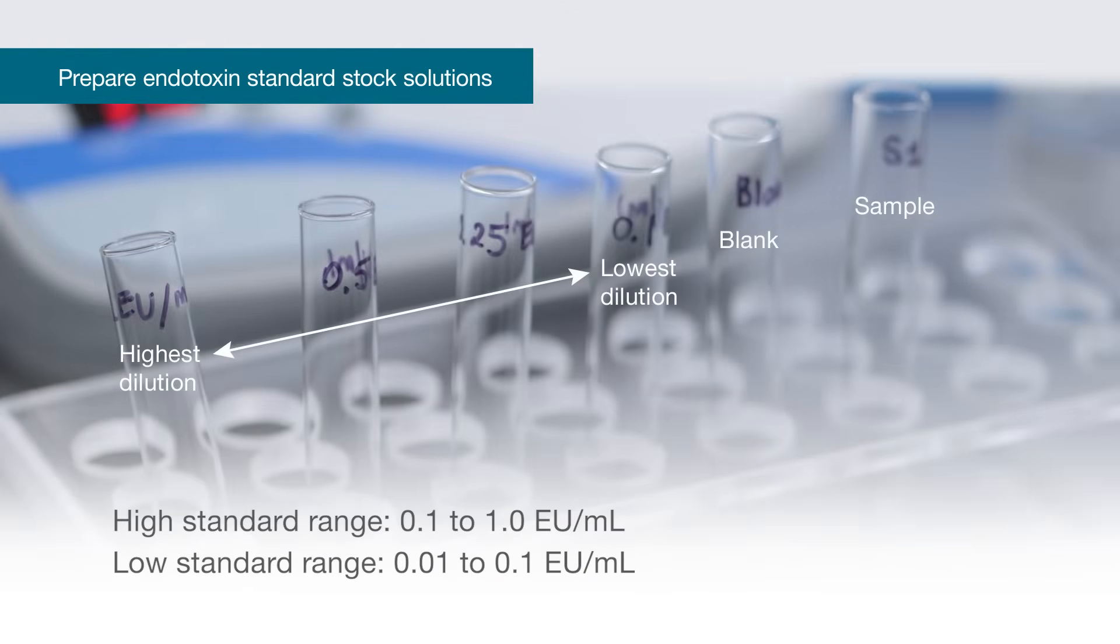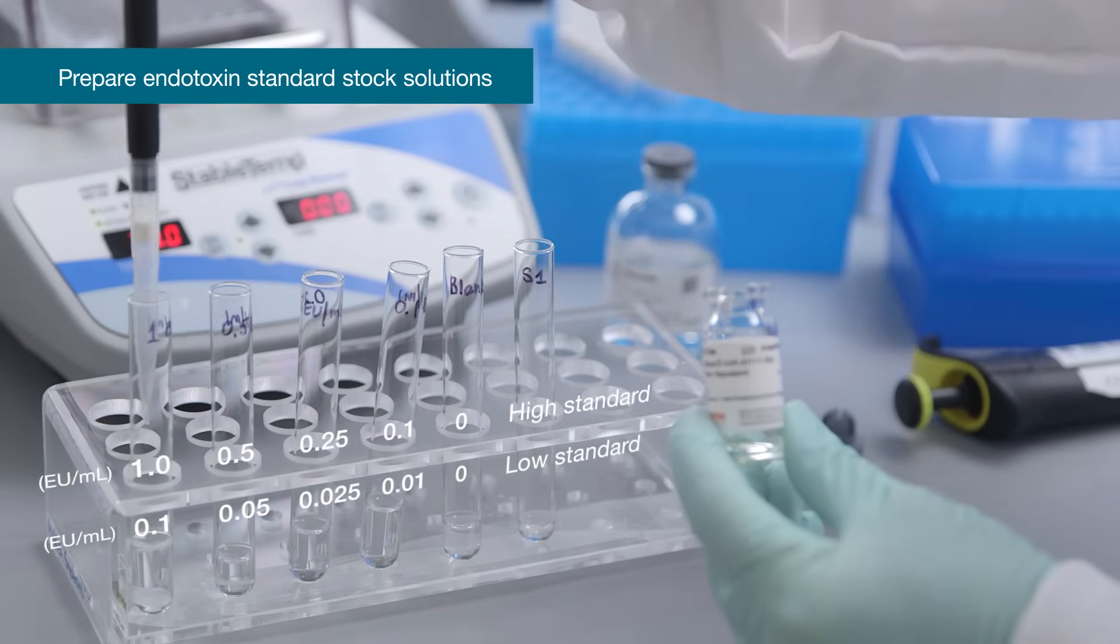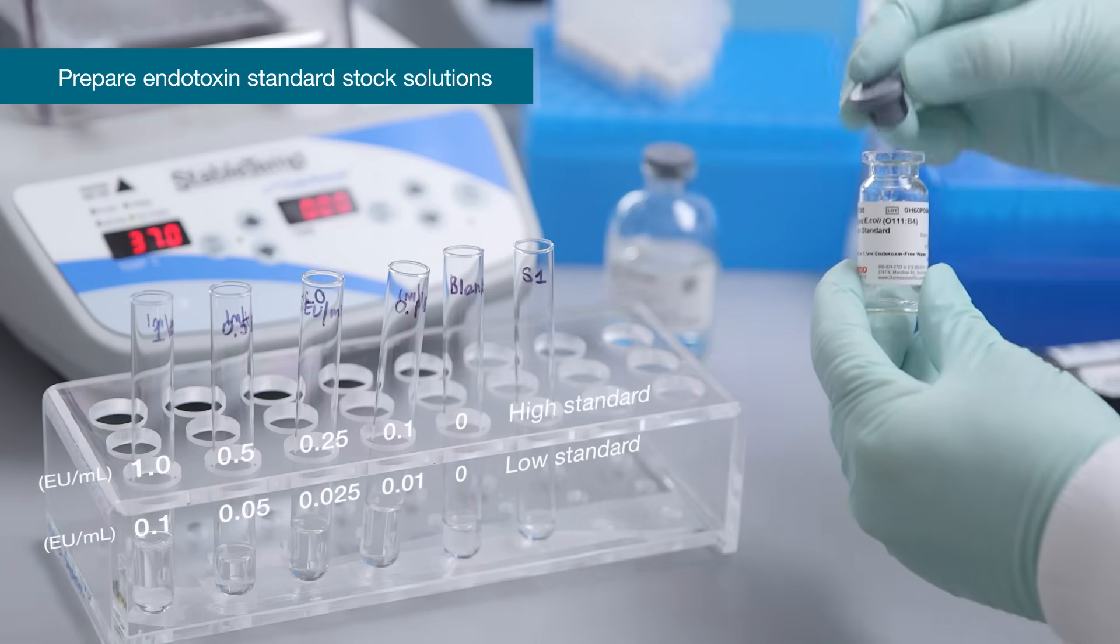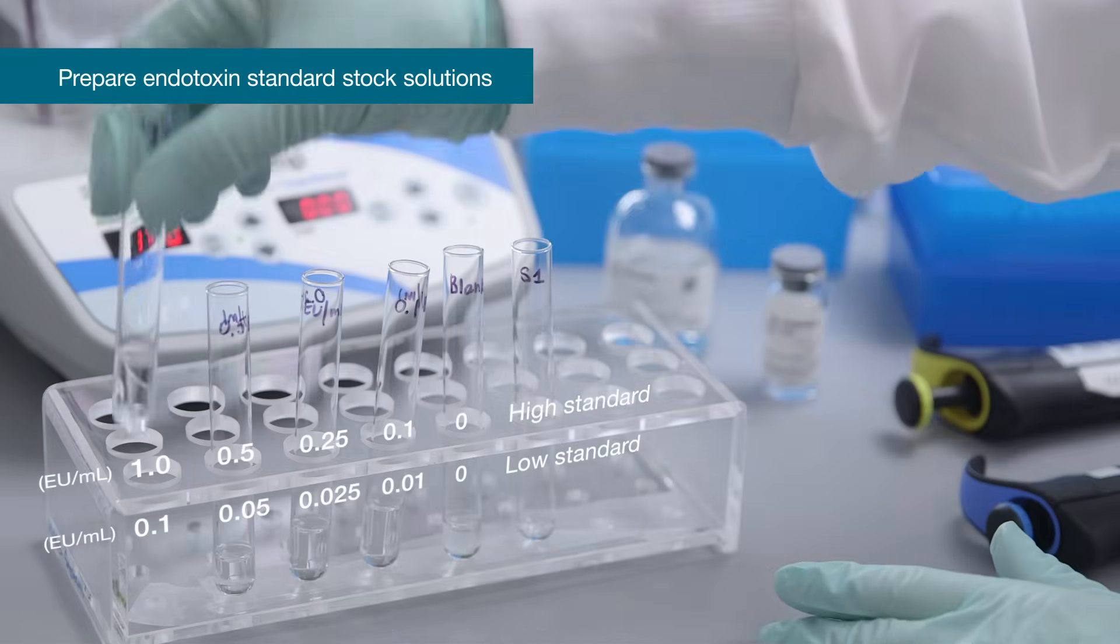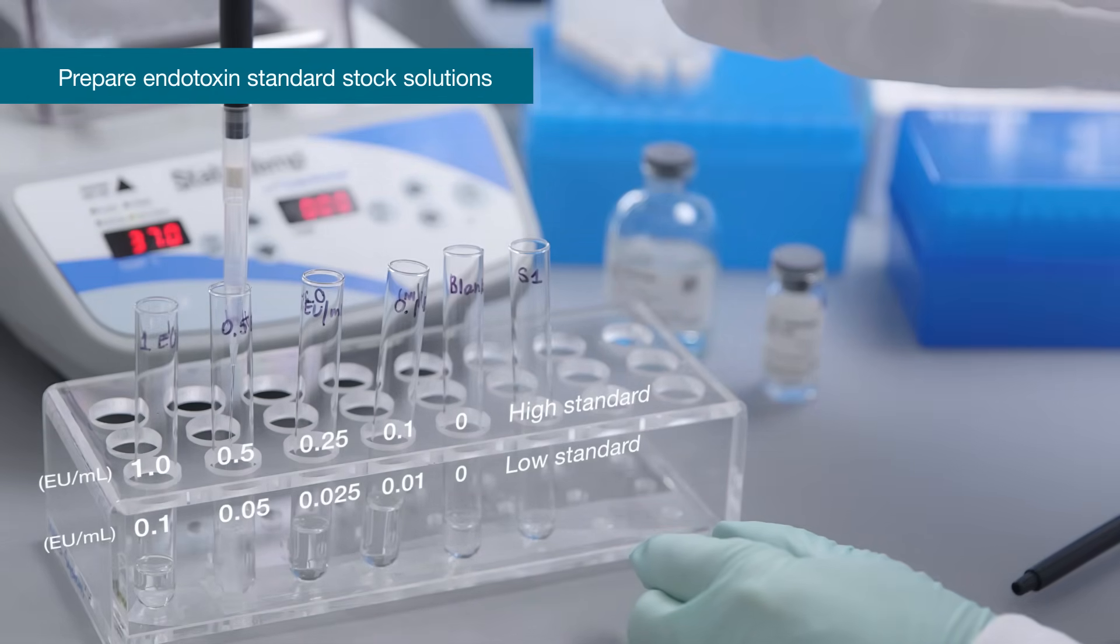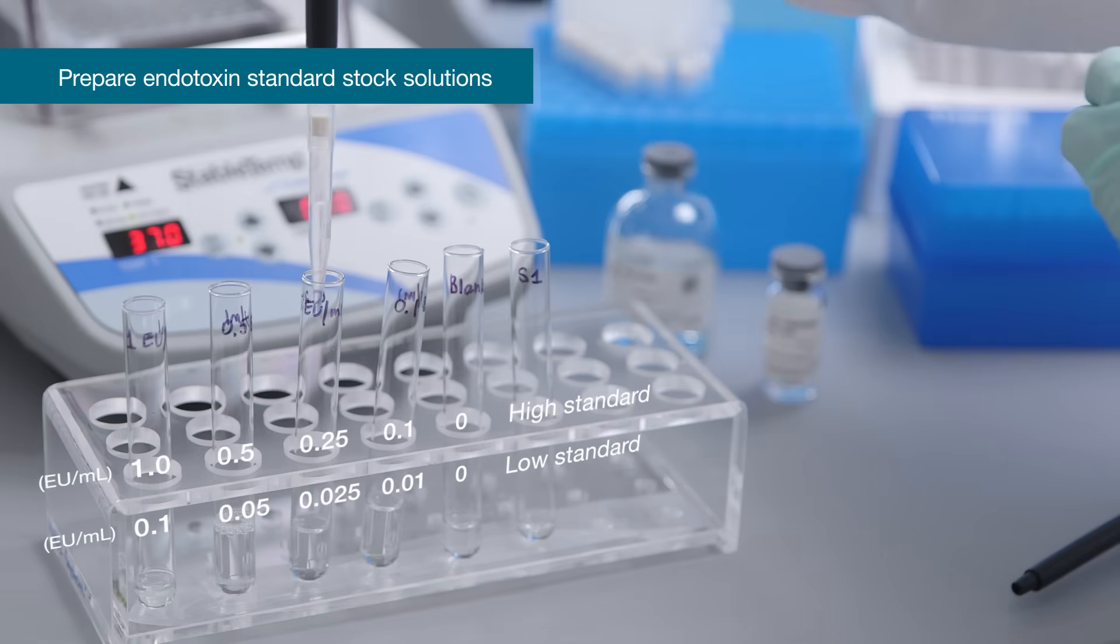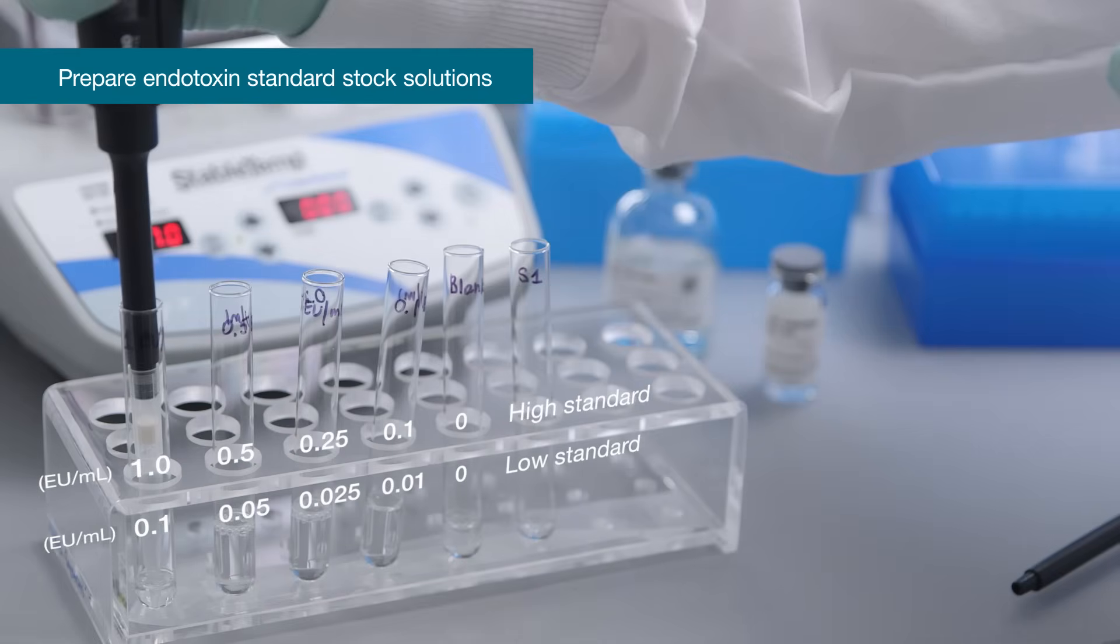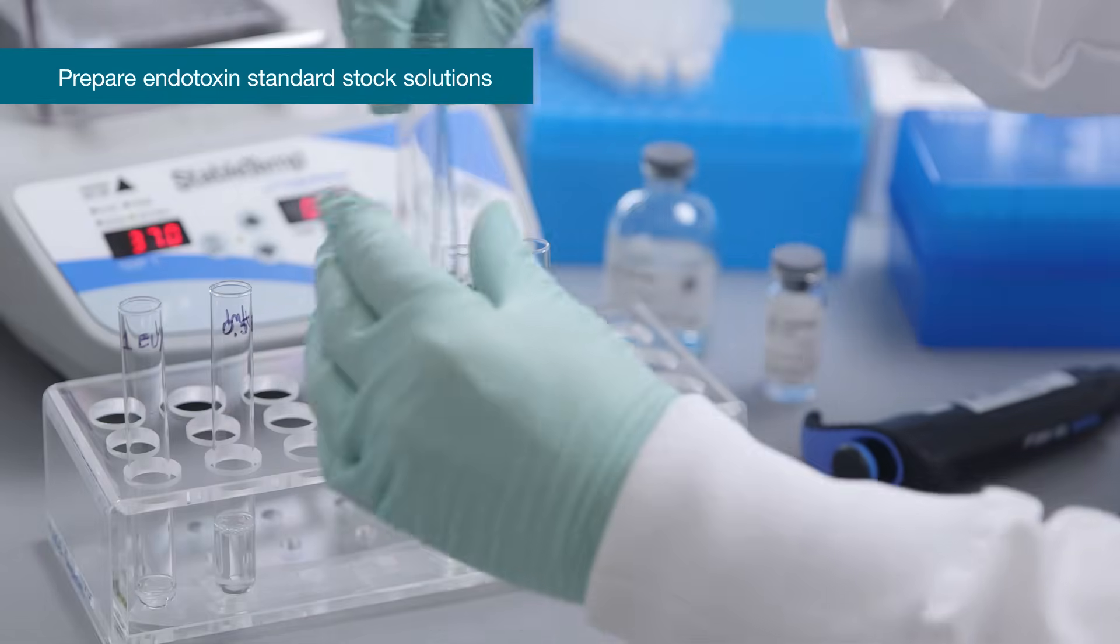Prepare dilutions for high standard or low standard range using endotoxin standard solution of 10 endotoxin units per milliliter. Make first highest standard dilution, vortex two minutes. Vortex the solution, pipette from first dilution to make all other subsequent dilutions. Vortex all three tubes together one minute.